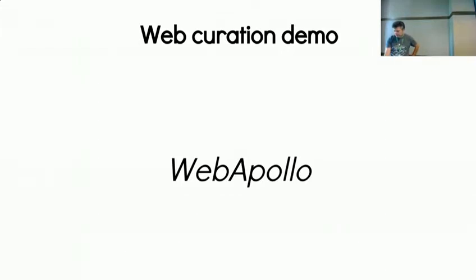I guess I should probably explain to people what all this stuff is. When you look at your JBrowse, it was just some genes, right? But Nathan's got all these different tracks, they're called. So what are some of the tracks you've got there? This is honeybee, by the way. So the different tracks, these first top two are GFF3 tracks.